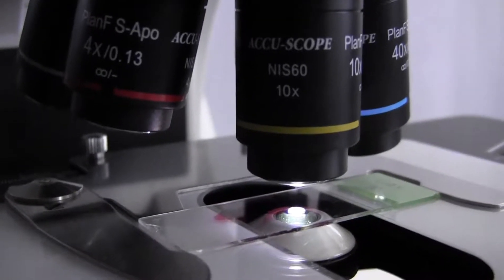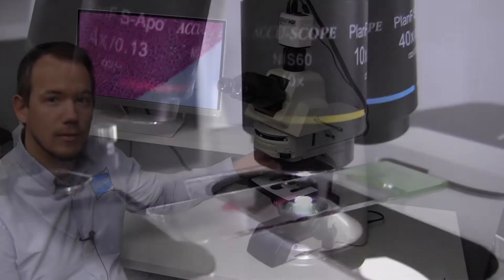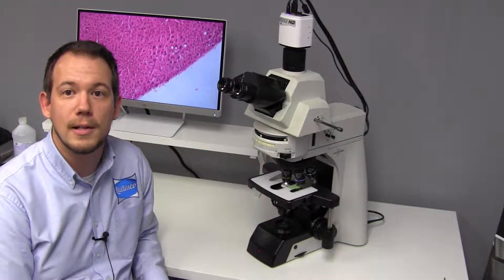On this particular microscope, we have the plan fluorite semi-apochromatic objective. This is a really good option for fluorescence microscopy.